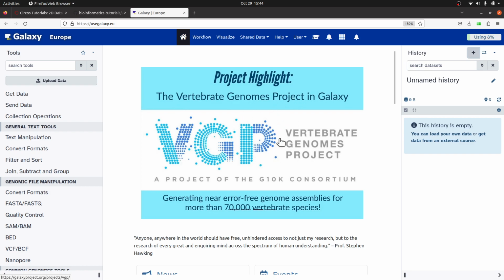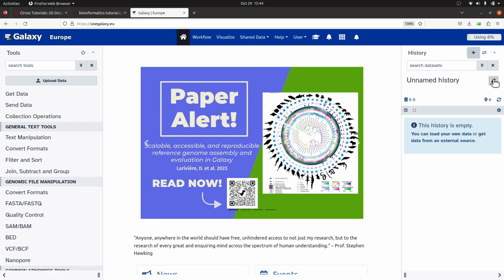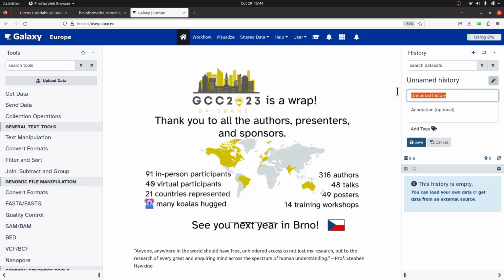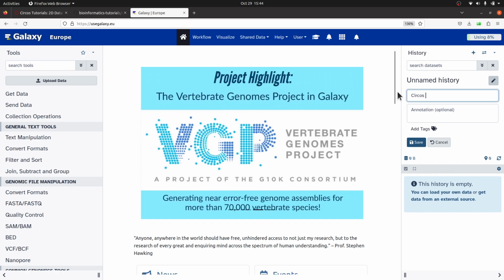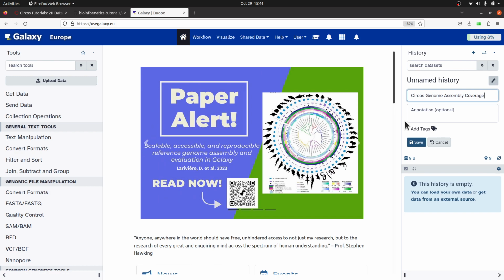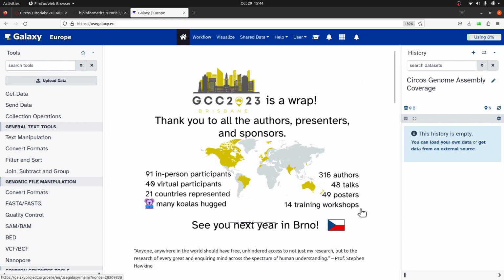So what I'll do first is to create a history. I'll come to the right side, click on plus, and then I'll get this unnamed history. I'll come to edit and rename it. I'll just say Circos assembly coverage, and I'm going to save it. Perfect. So now I'm ready.